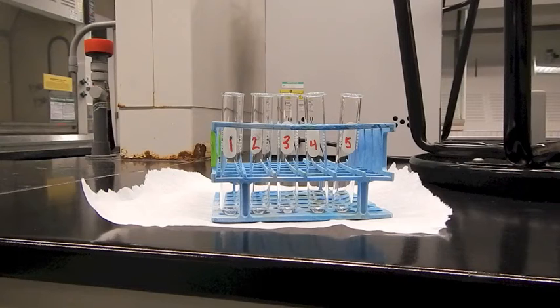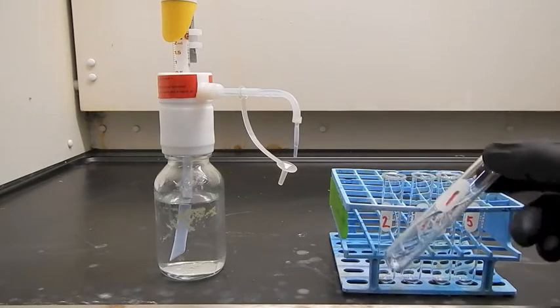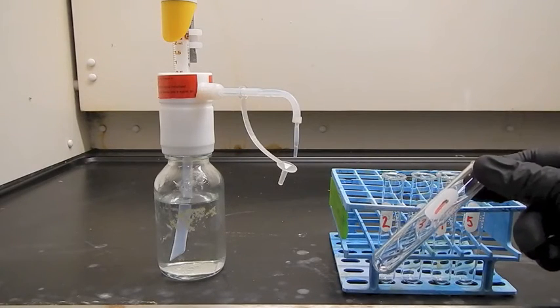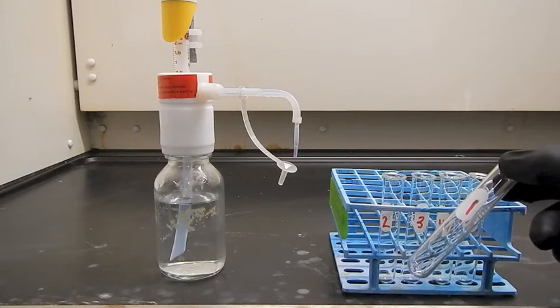Part C of the solubility lab, the first thing you're going to want to do is to get 5 clean and dry test tubes, and I've labeled them 1 through 5. So once your test tubes are dry and ready to go, basically all you need to do is add in 1 milliliter of each of the solvents that you're going to be testing into each test tube. So in test tubes 1 through 4, each one of those is going to start with 1 milliliter of water.